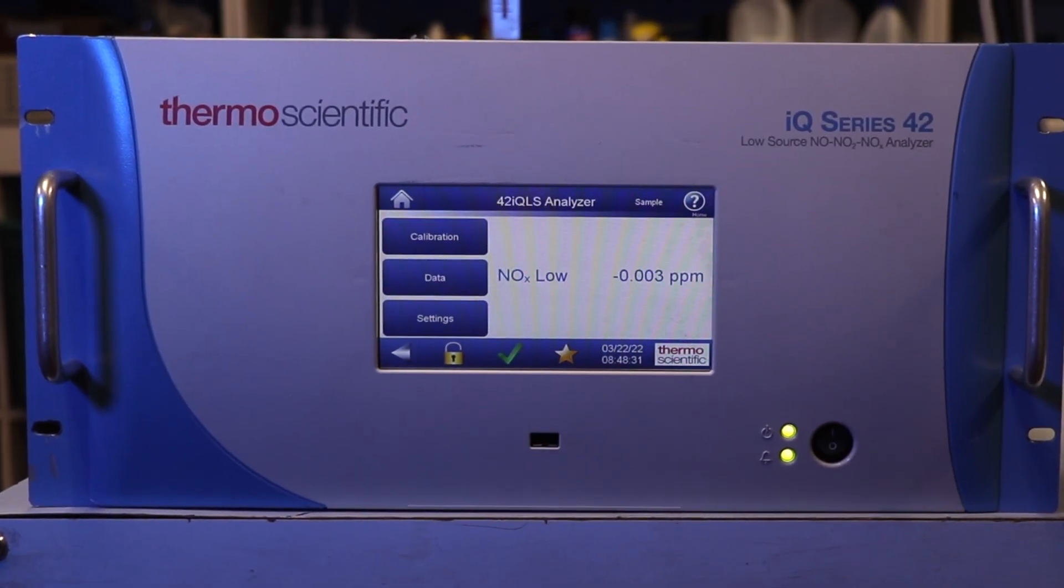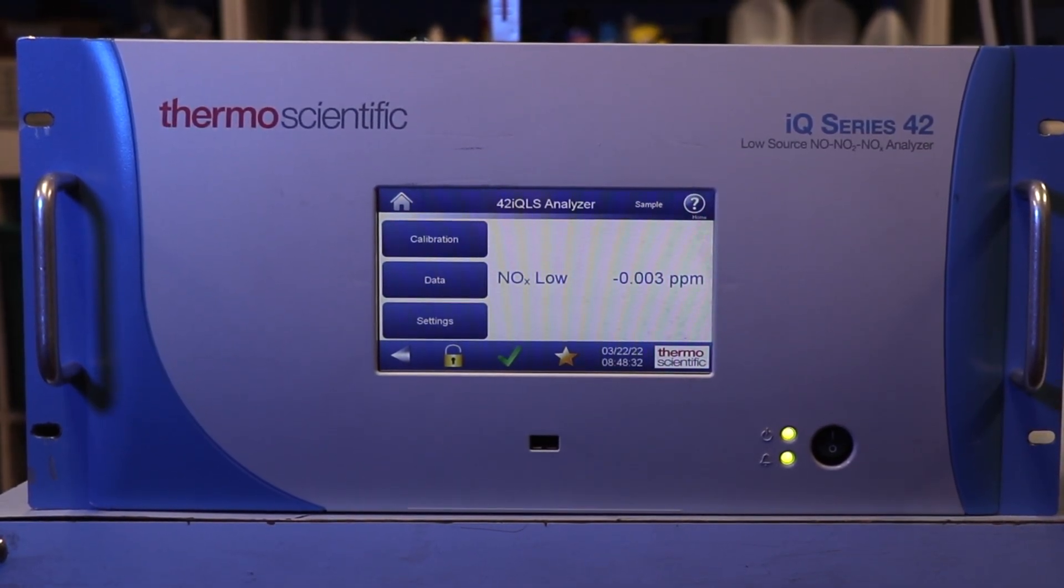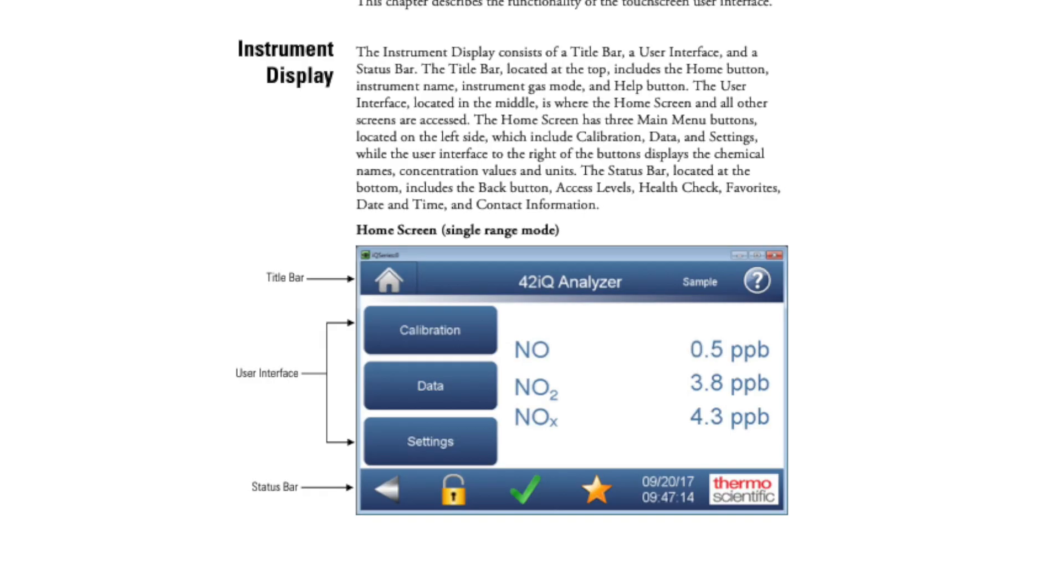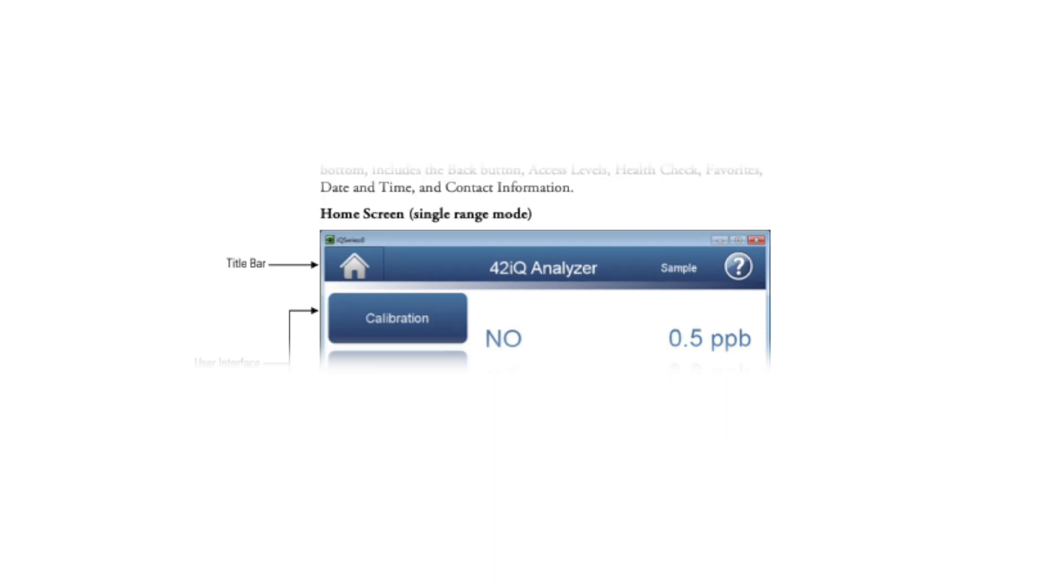One of the major differences moving from the iSeries to the iQ is the touchscreen interface. The new display can be broken down into three sections. On top, the title bar, which includes the home button, title text, gas mode, and help button.